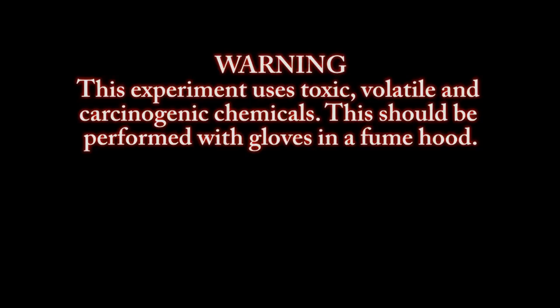Warning, this experiment uses toxic, volatile and carcinogenic chemicals. They should be performed with gloves in a fume hood.